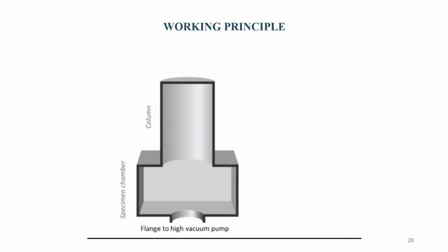Then there is a specimen stage where we can place our object of interest or sample of interest. This specimen stage can move left to right, upward or downward.